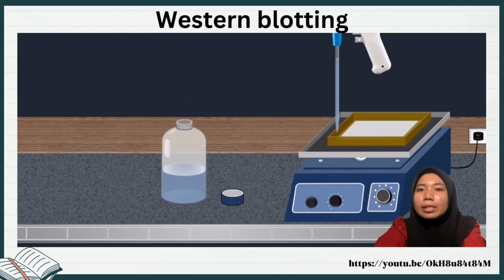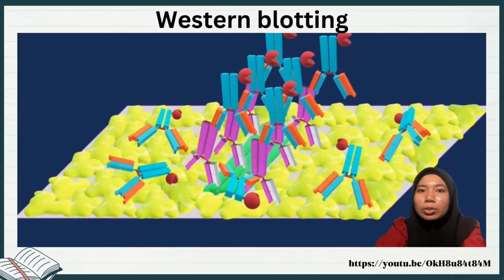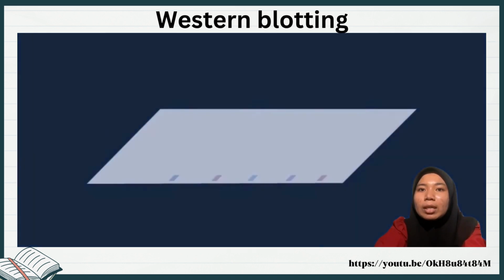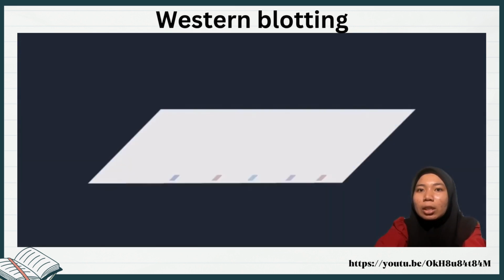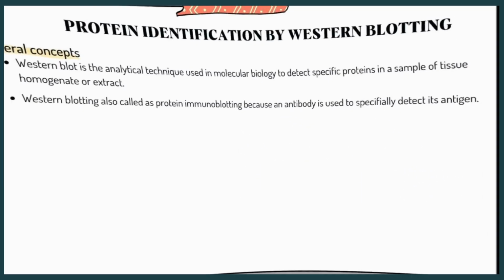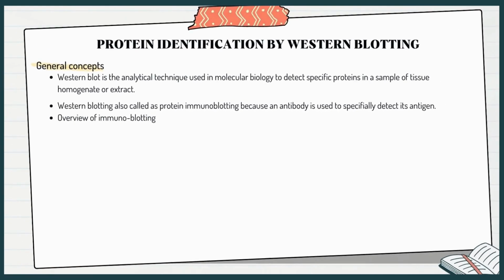The last step is protein detection and analysis. Protein detection is achieved when a conjugated enzyme interacts with the substrate introduced to the whole membrane, causing a chemical change in the form of a colored substance, allowing the researcher to mark the location of the prey protein. So, in conclusion, the application of Western blotting can help in determining the diagnosis of infectious disease, determining if a protein is expressed, and many more.